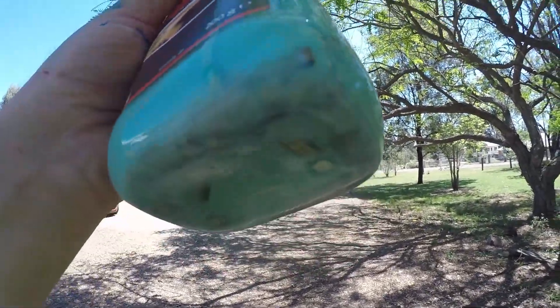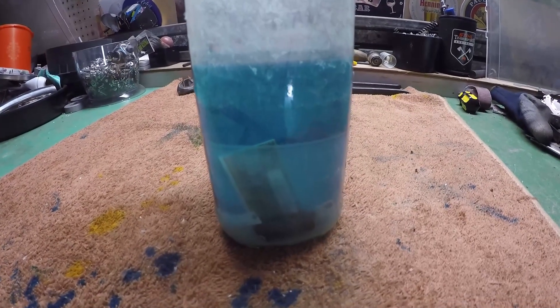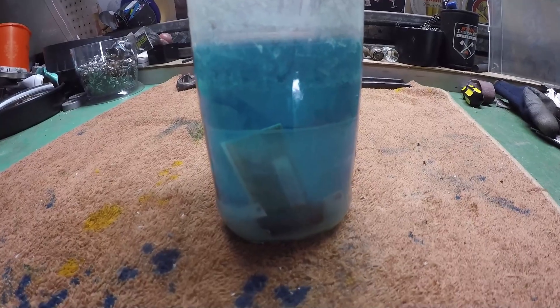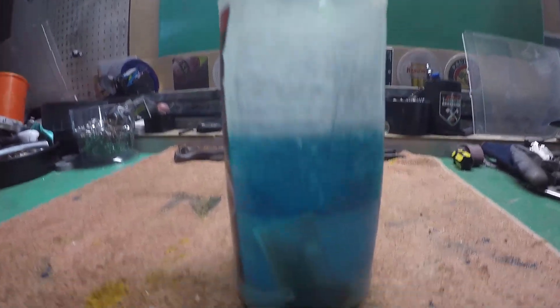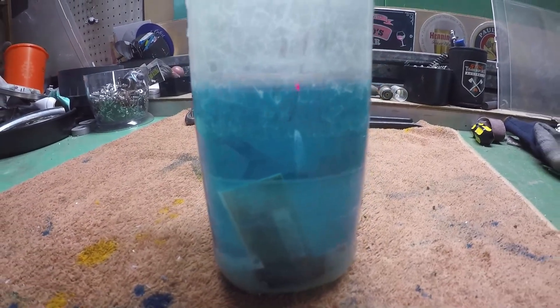Okay guys, it's Sunday — seven days since we put all these foils in the jar. It seems to have calmed down from the frothiness. There are different layers of colors, a lot of blue, and a lot of sediment in the bottom. I don't know if it's focusing in very well.